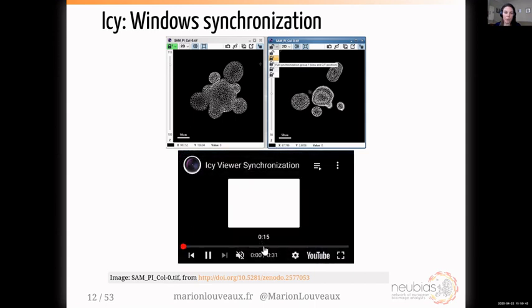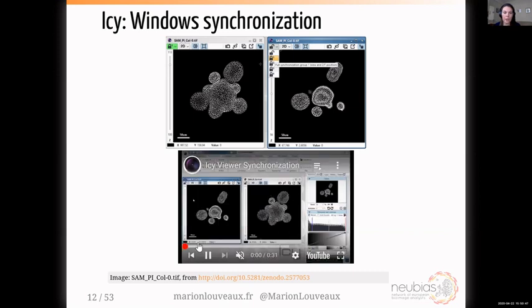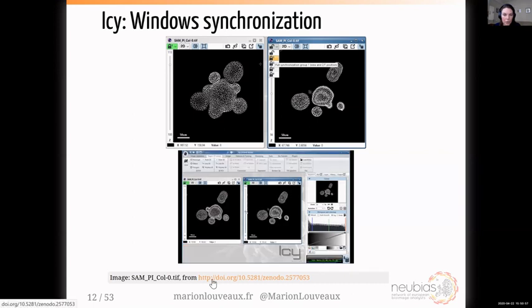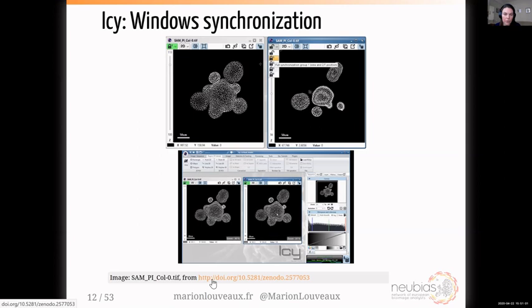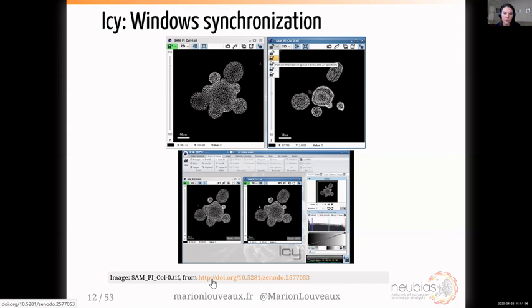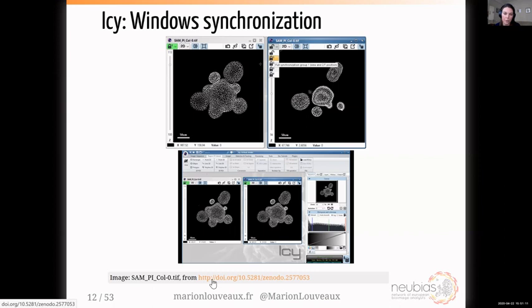With this synchronized view, I'm showing the behavior of the synchronization. If you zoom in or out, move in X, Y, or Z, the behavior of both windows is synchronized. You can also draw some ROIs and they will appear on both windows.